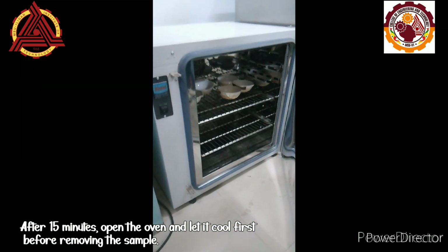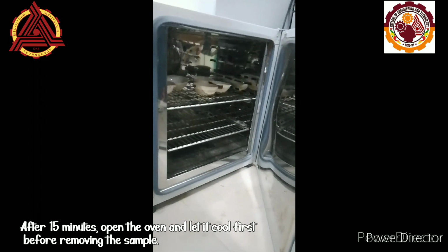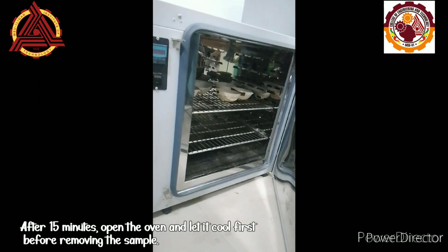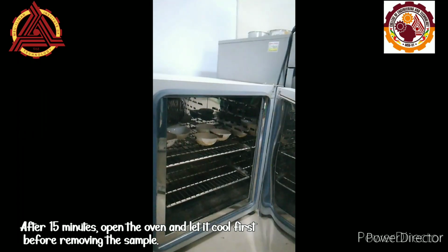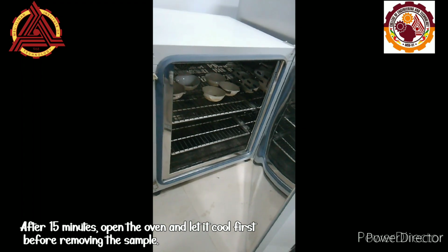Then, open the oven but also back away from it at the same time since the hot air escaping from the furnace can burn bare skin. Allow the oven and sample to cool down before removing the sample from the oven.